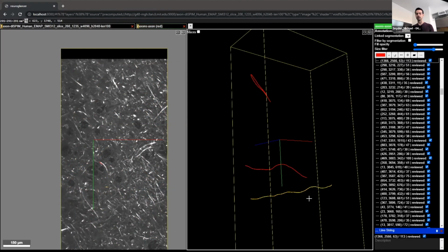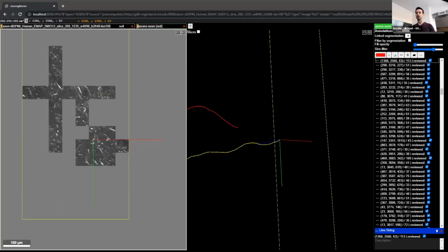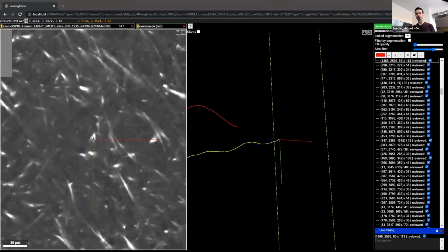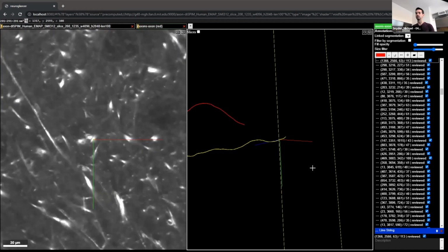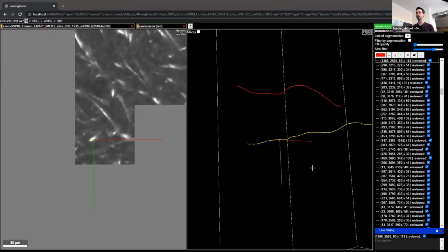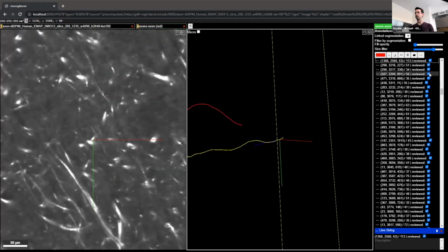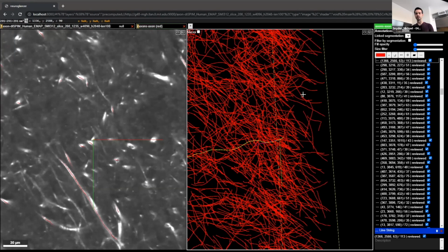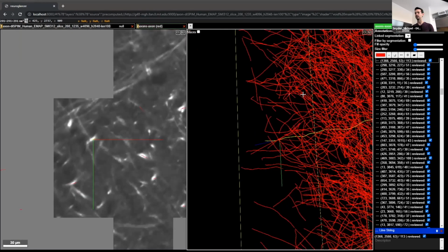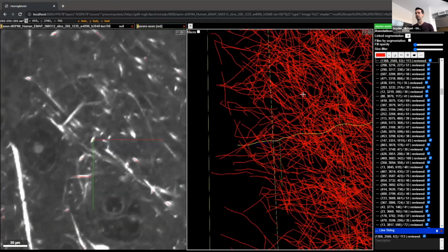And for example, select one of the interesting fibers, which will be highlighted in yellow here, and then we can start to follow it along, either continuously as an animation, or at individual steps to jump to the next control point, for example. And this becomes useful when, as we'll reduce the size filter here, you're amidst a sea of large amounts of data, and you want to try and follow through the imagery to make sure that your association is making sense.